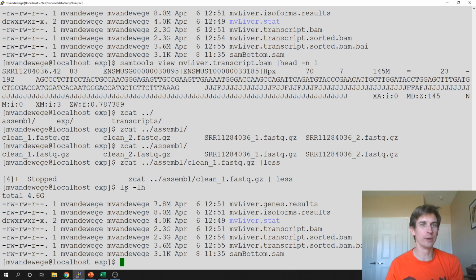And so what we do whenever we sort, and SAMtools is responsible for sorting. Believe it or not, sorting is a very important algorithm, not only in computer science, but also bioinformatics. In computer science courses, sorting is one of the first algorithms that's really described in depth.